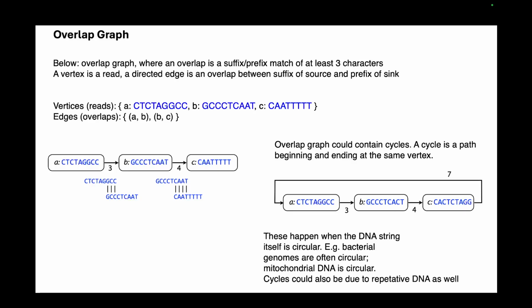Because for creating reference genomes, you need to build the genome from scratch, and the only way to do it is basically using genome assembly. So while you are trying to do that, if you have a lot of repeats in your reads, it's very hard to resolve that portion of the genome. So that has been an area of research until we got the whole Y chromosome there. But it's still a topic of ongoing research, right?